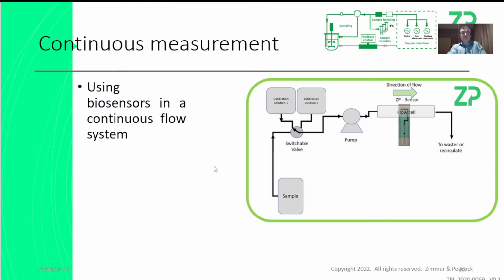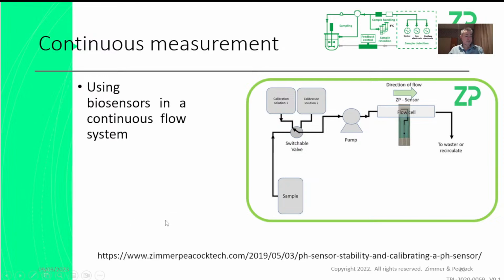I'd almost bring up the case of a pH sensor: in most labs, there are always 2 or 3 bottles of calibration solution. So you can see that some types of electrodes, like ion selective electrodes, do have drift in them. And we do cover this quite a lot in our workshops. So I hope you could attend some of our workshops. But I do have a note about this.